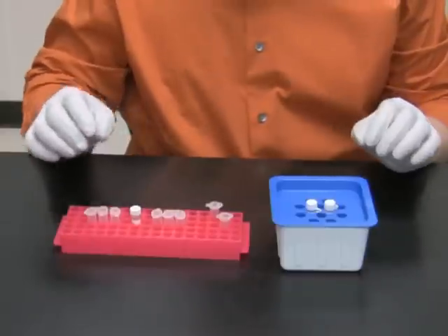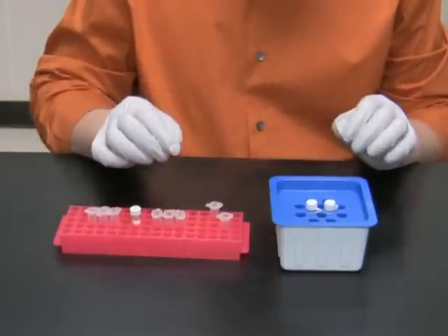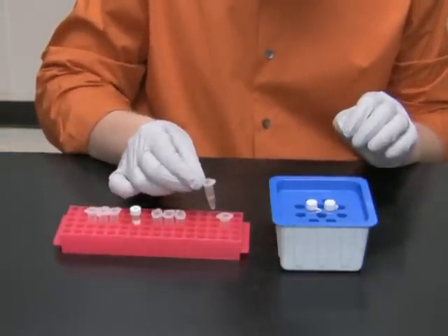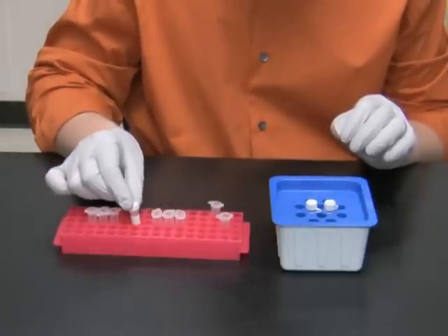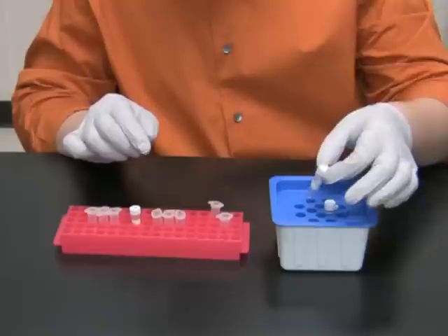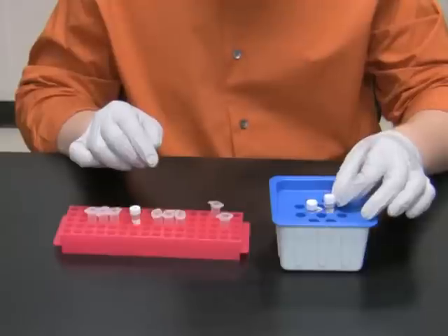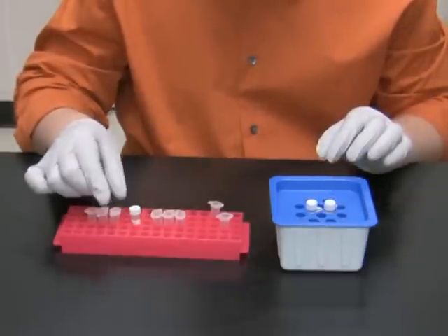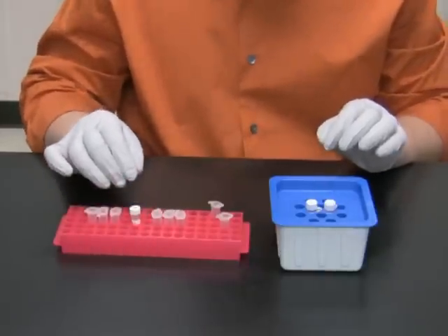Right now I'm going to set up a restriction digest with the plasmids that we just isolated. For one reaction I will need 16.5 microliters of double distilled water, 2 microliters of NEB Buffer 3, 0.25 microliters of XhoI, 0.25 microliters of BamHI, and 1 microliter of plasmid DNA. I also prepared 3 new Eppendorf tubes for the restriction reactions.